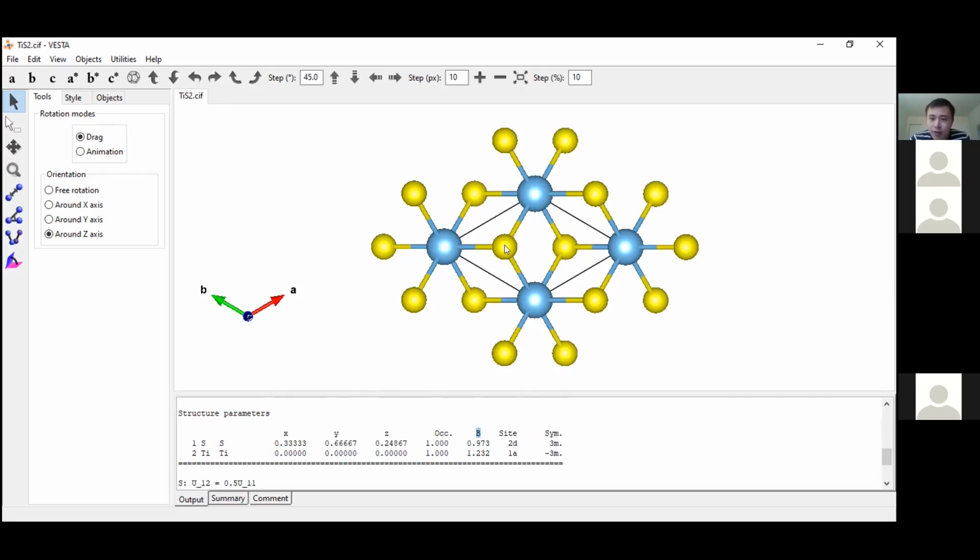In fact, let's say you count 1 billion atoms, they would form a Gaussian distribution with the peak at the exact position. But other atoms form a close to Gaussian distribution in terms of deviation from the perfect site. And because both can be approximated by Gaussian, this B value can be used to describe both the thermal vibration and the static disorder, which are all integrated in this B value. Right.